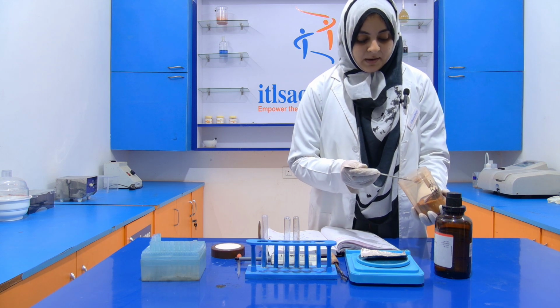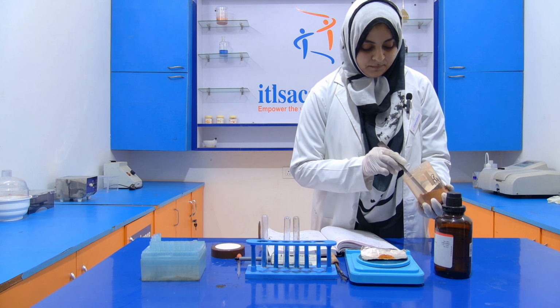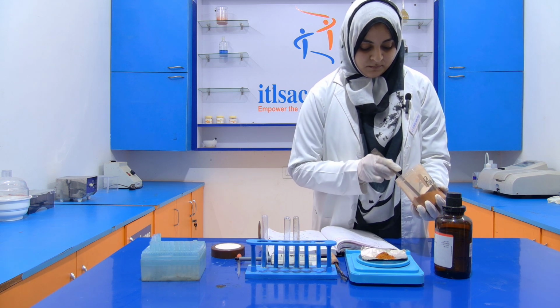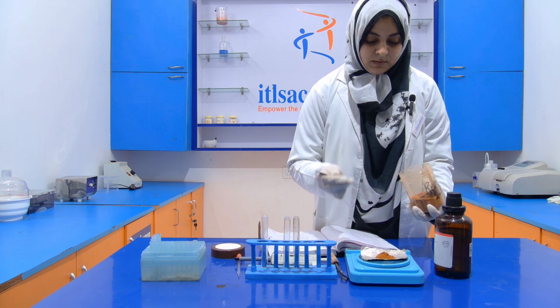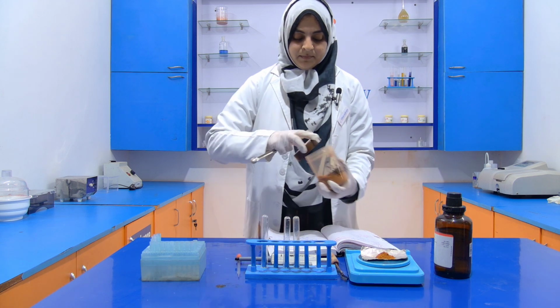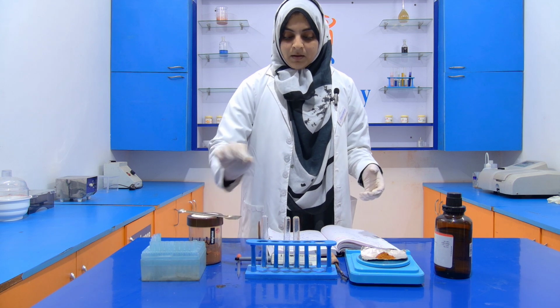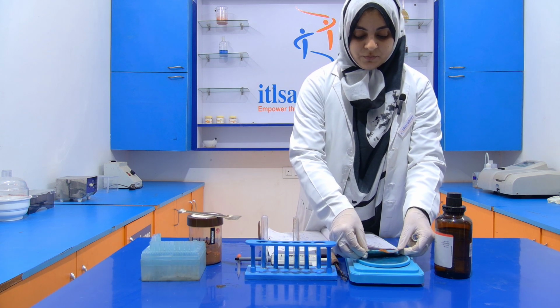You have to take around 2 grams. So this is around 2 grams. Then transfer this 2 grams of red chili into a test tube.